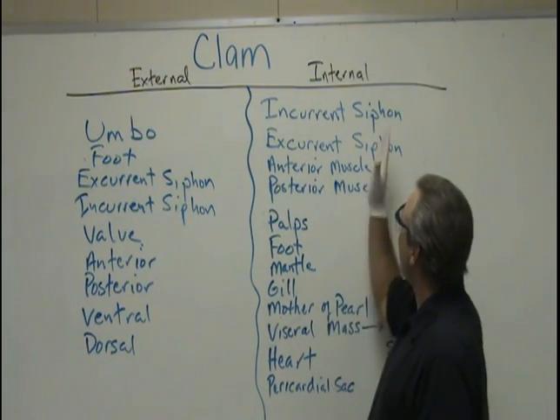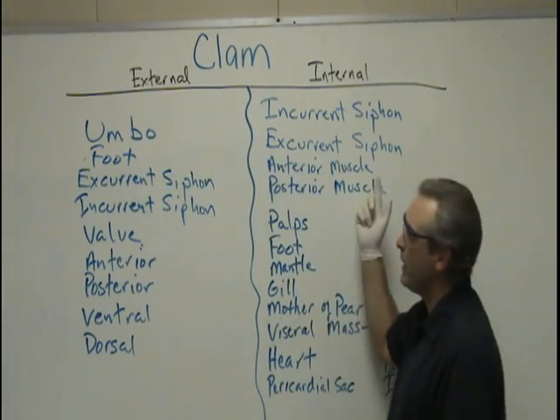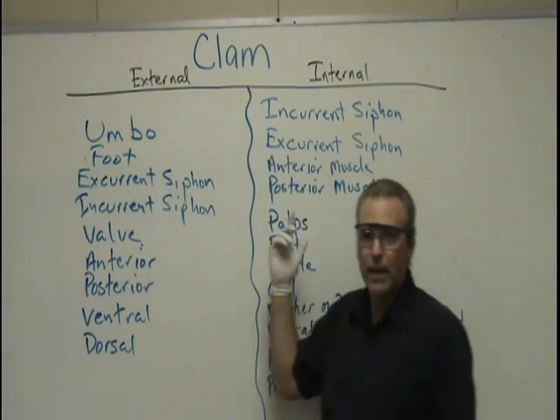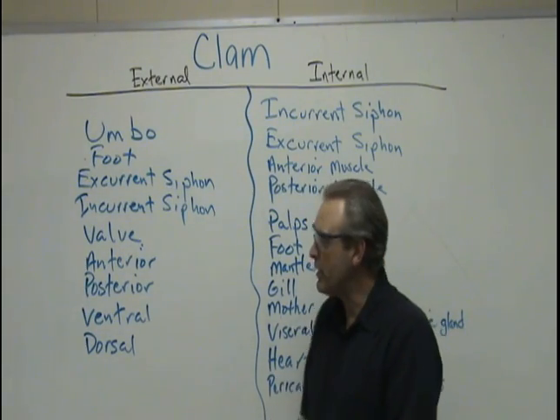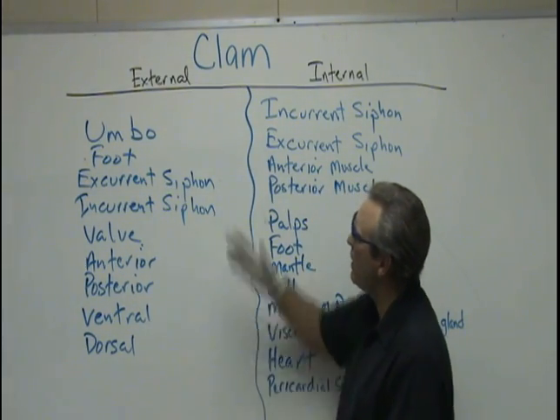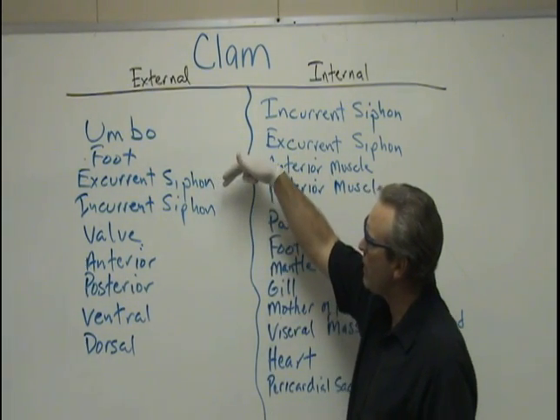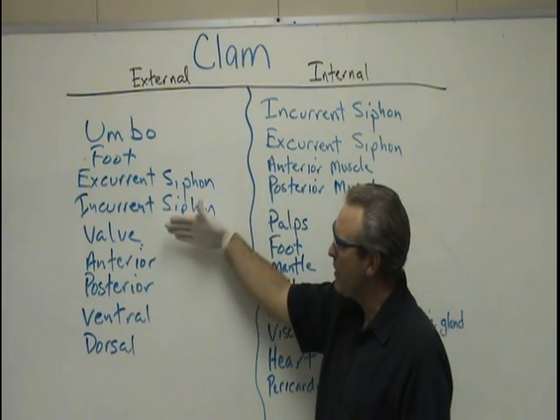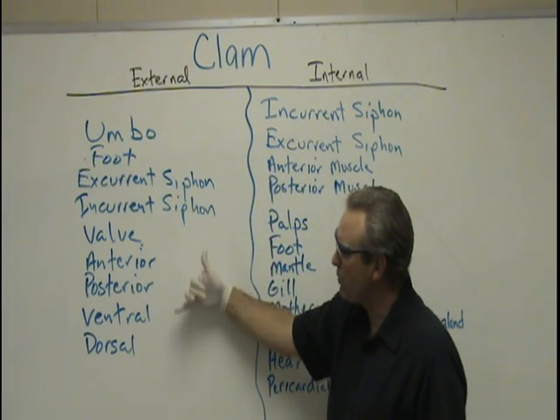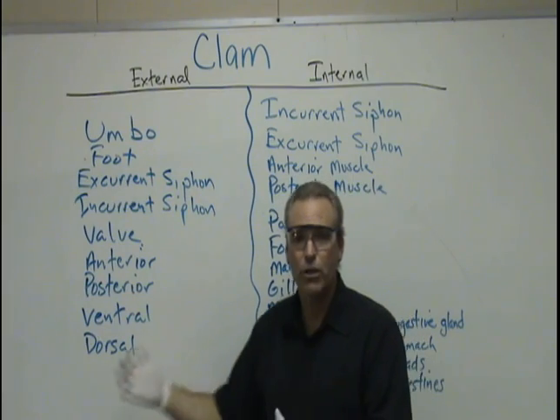We're going to divide it up by external and internal. These are all the external things that we need to look at: umbo, foot, incurrent siphon, excurrent siphon, valve, anterior, posterior, ventral, and dorsal. You should know those.